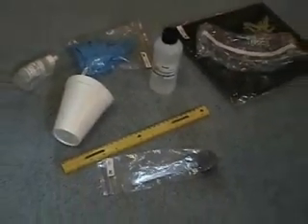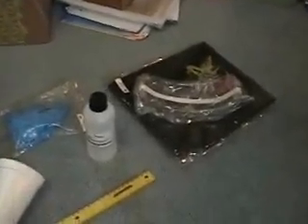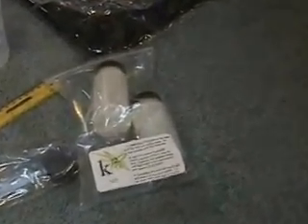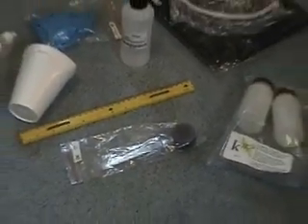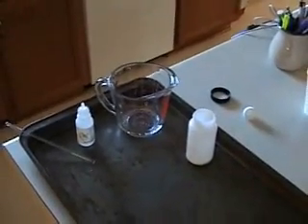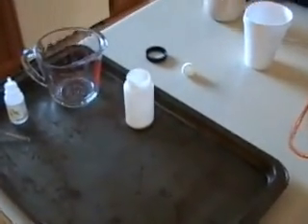And probably the most important thing that you're going to need, well, where did I have it? Hold on. What did I do with that? There it is. This is right there, and that's what your phenolphthalein solution is going to look like. Inside there, and we'll look at this again in a second, is your clear plastic square container. You also need a ruler, which is provided for you, and a scalpel. And all those materials are what you're going to need for this lab. Things as you get started, make sure that you're having your agar material, which is in the white bottle.